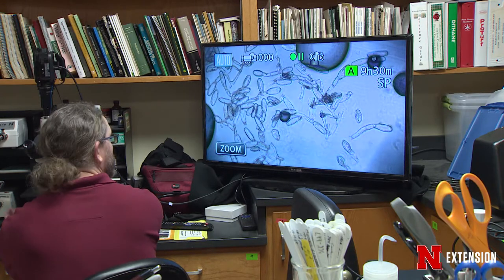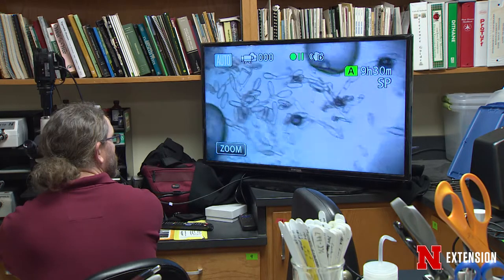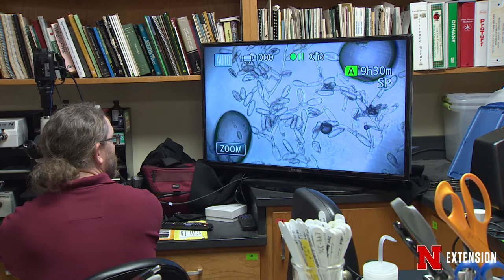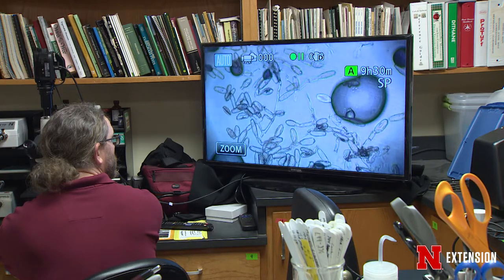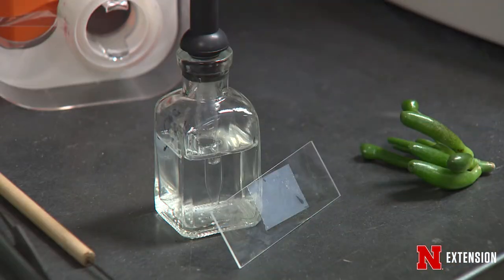That allows us to see those individual spore types to determine what exactly we are looking at, and the shape of the spores often determines what we're seeing. Once we have an actively sporulating fungal pathogen on the leaves, one of the easiest methods we can use to diagnose it is what's called a wet mount.